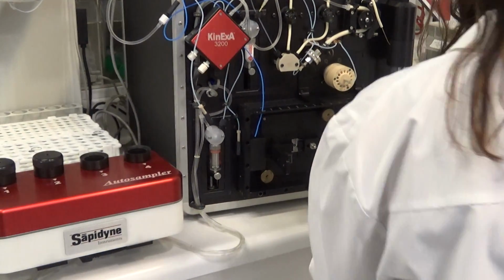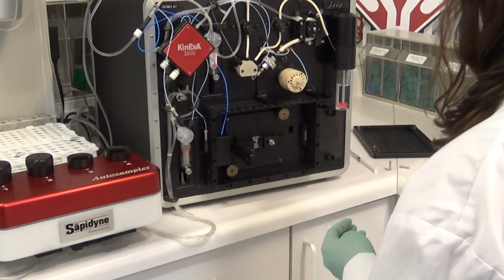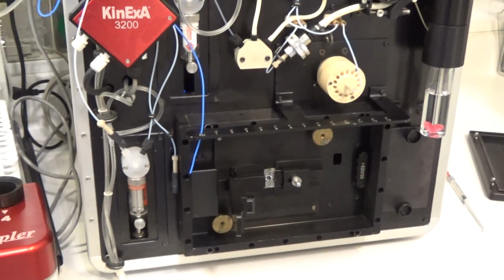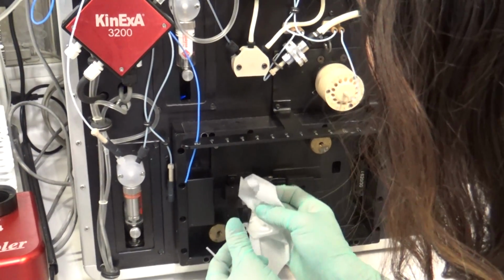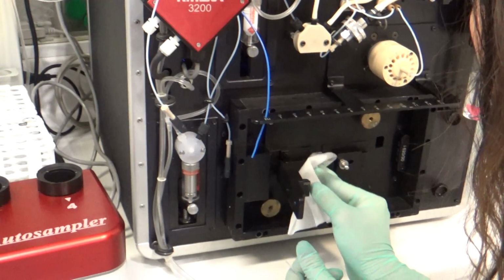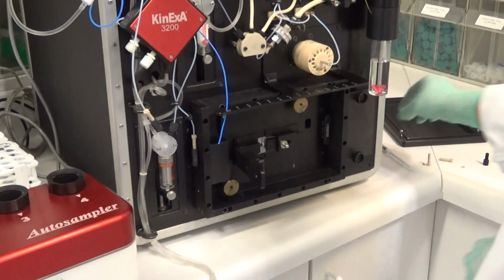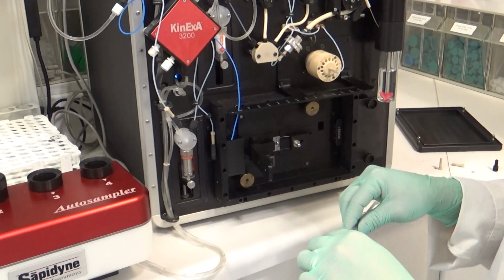Okay. Then, when you have your new flow cell, you'll want to make sure that you clean both the reflectors with denatured alcohol, or you can use 70% ethanol as well. This cleans off any of the old residue from the previous grease that you used. Once that's done, you can grab your index matching fluid or dielectric grease.